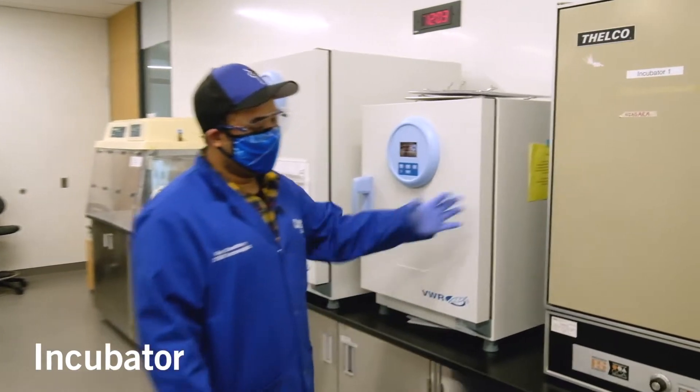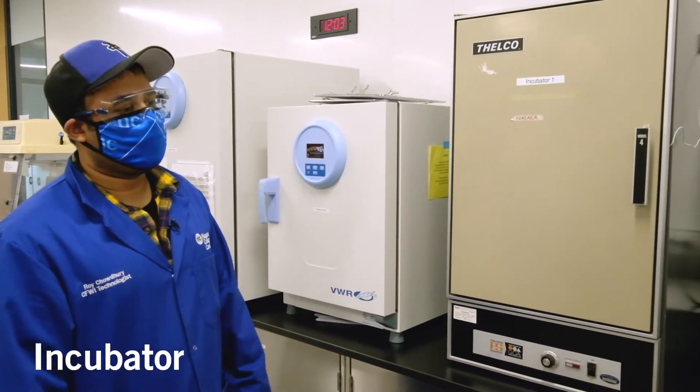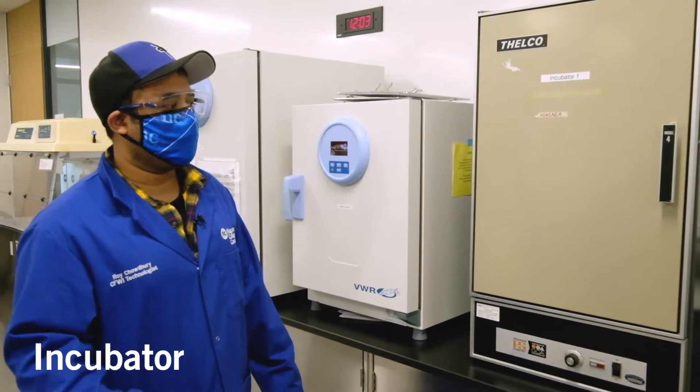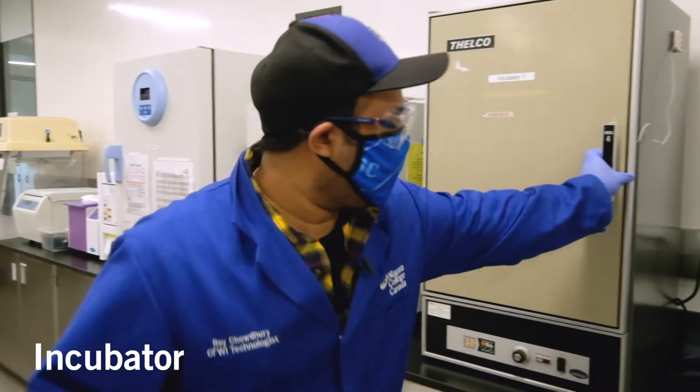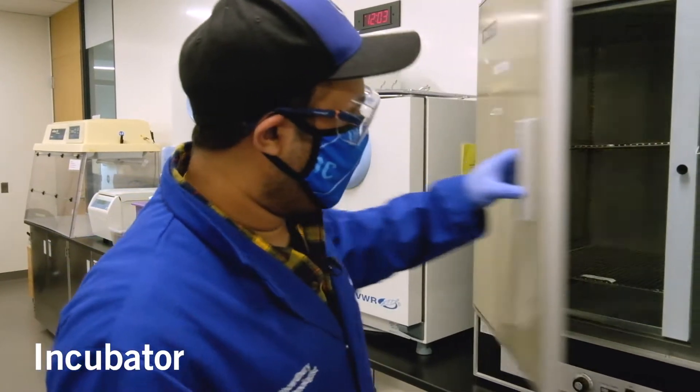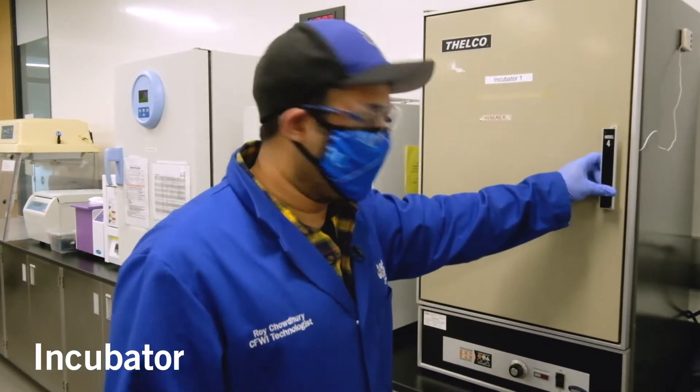As you can see here, there's an incubator. Incubators are used to grow microorganisms. Typically, students tend to put their plates and cultures in here and grow them for 24 to 48 hours, ideally at around 35 degrees Celsius, which is the optimal temperature.